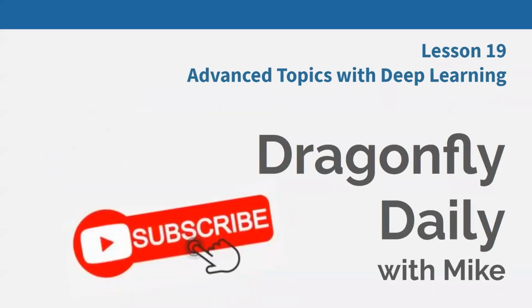Today's content and topic is advanced topics with deep learning. This is the fifth lesson in a row on deep learning. I think you're enjoying them. I think it's telling you a lot about how you can use deep learning to really improve and augment your scientific imaging workflows. As a reminder, we've already looked at how deep learning works. We've looked at different applications such as super resolution and denoising and image segmentation, a topic that really matters to everyone.